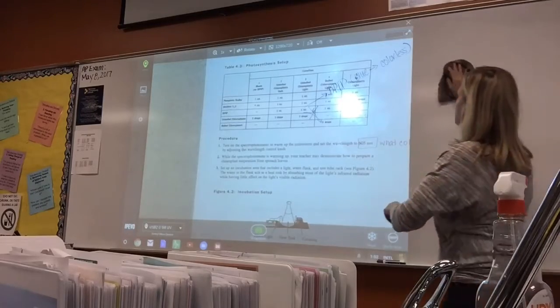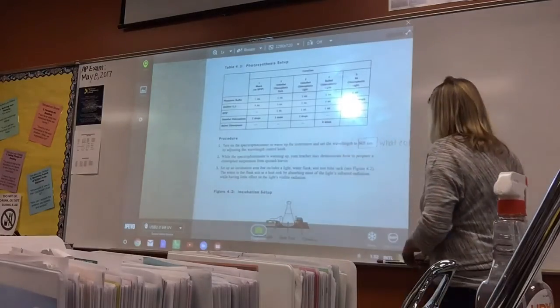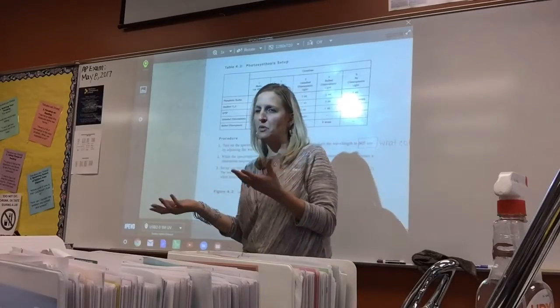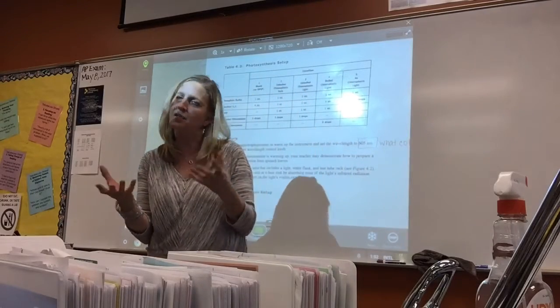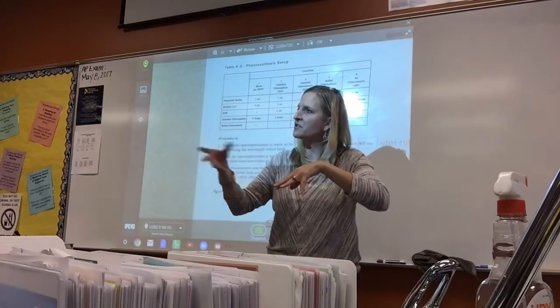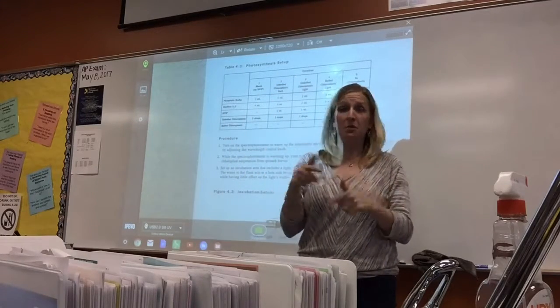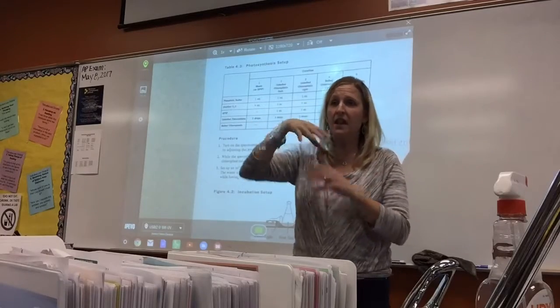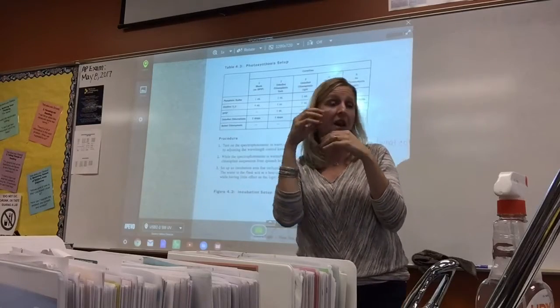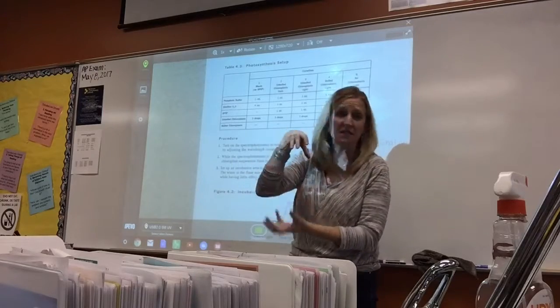using a chloroplast solution. So let me just speak for a minute about how in the world you get a chloroplast solution. So what you would do, you take some leaves, spinach would work. You take some spinach leaves, you buy a bag of spinach or whatever at the store. You take a blender, you stuff the blender, cover the blades with spinach leaves, you pour in some water, like a water sugar solution in it, and you blend it. And it'll break up those leaves, and what that's doing is breaking up all the tissues and all the parts and so on, and actually agitating the cells and so on. And then you get this like slurry of this green spinach mix.